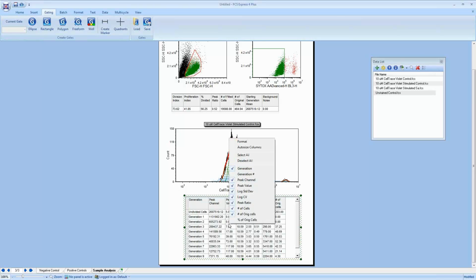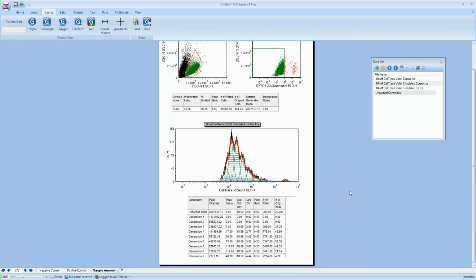So the software is doing all these mathematical calculations in real time as you insert these plots. They're going to change as you change fit parameters. They're going to change as data files are changed. So that's all available to you here.